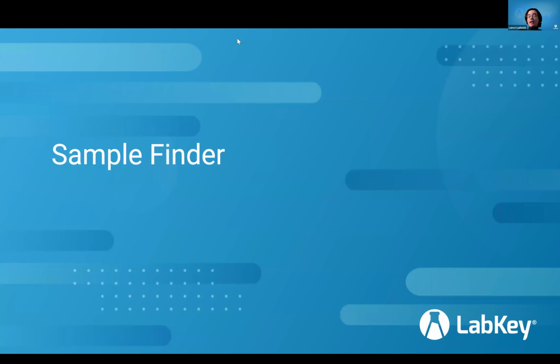So now that we can organize our data in a very useful way, we need a way to pull a list of samples based off of that data. And that's where Sample Finder really comes useful and is probably the top feature that would have helped me during my project. This would have saved me so much time, so much energy, and is something that I think more users should be aware of and be using pretty actively if they're going to be doing something like discarding of their samples.